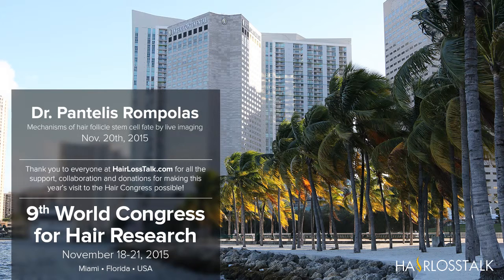So for that, we looked into catagen, and here you see a movie of hair follicles undergoing catagen. You can see cells undergoing apoptosis, like in this example here. You can see the behavior of the cells that are differentiated and part of the inner root sheath and hair shaft. What did we learn? So the first thing we learned is that during the catagen process, the differentiated lineages continue to be excluded from the skin.